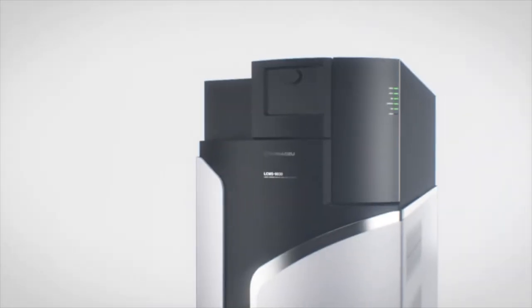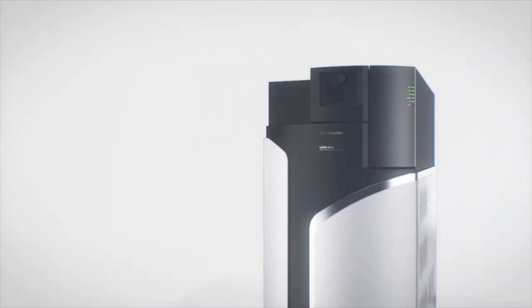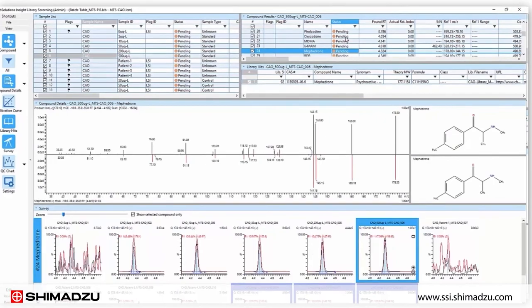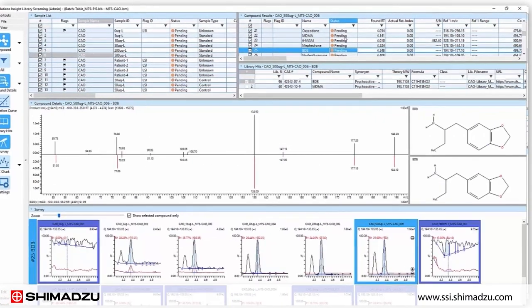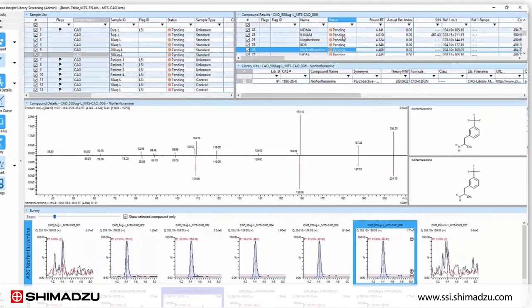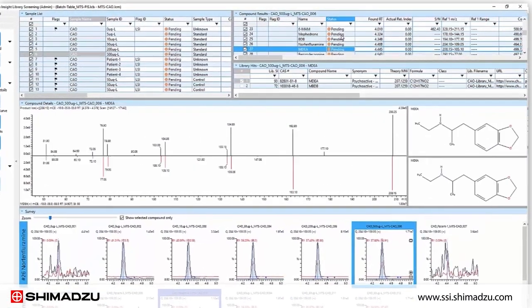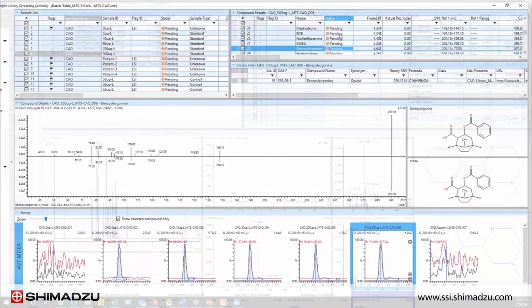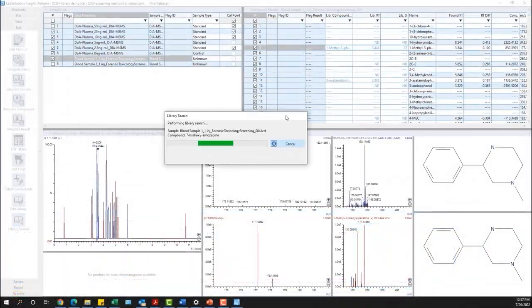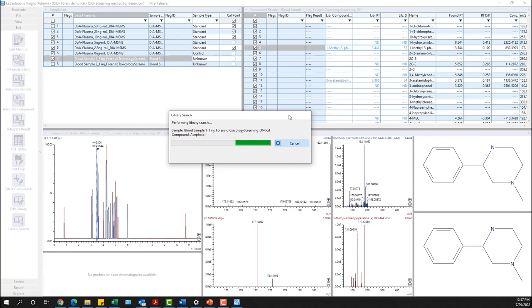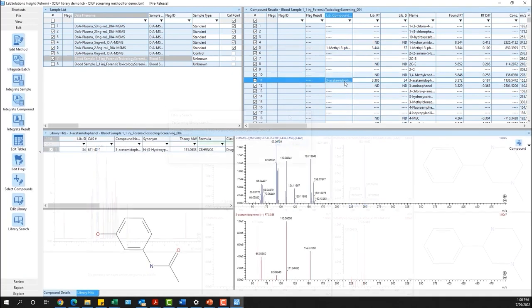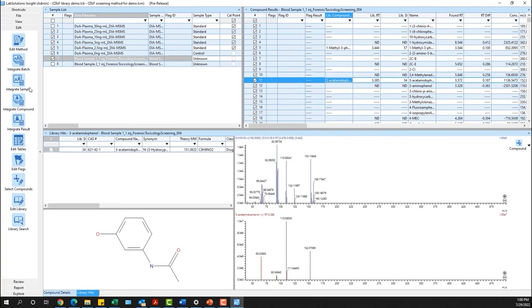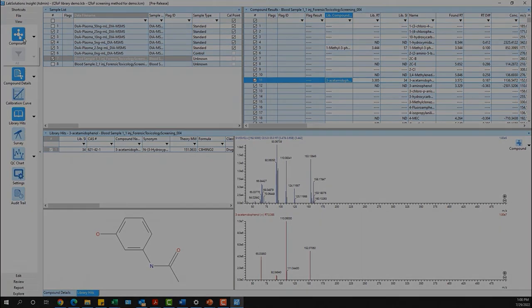Data acquired with a Shimadzu QTOF system can be analyzed easily using LabSolutions Insight Explore software. Utilizing the library searching and compound identification functions within the software provide a simplified workflow with up to four degrees of confirmation for convenient data processing and reporting.